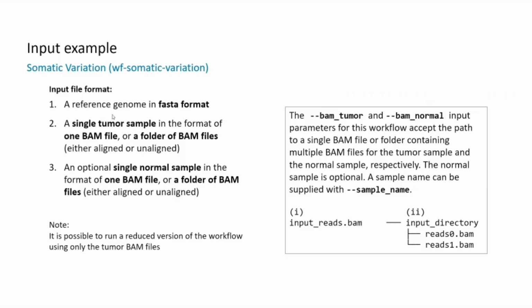Once the sequencing is done, normally the output can be chosen to be FASTQ or BAM. But if modified bases are something we are looking at, the data will definitely be in BAM format. If we forgot to tick the option to output BAM files, and did not identify modified bases during the sequencing run, then we might need to rerun the basecalling, converting the raw signal files of pod5 into BAM files, in order to do the analysis. And this pipeline has now been updated.